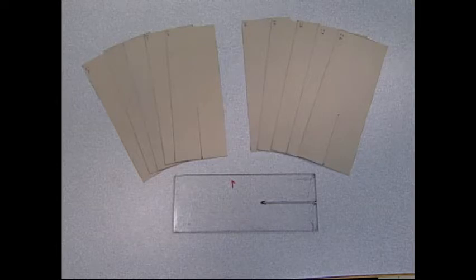The tongue tear test is also referred to as the single rip procedure. ASTM test method D2261, test method for tearing strength of woven fabrics by the tongue, single rip method. A rectangular specimen is cut in the center of one short edge to form a two-tongued or trouser-shaped specimen. The fabric is tested in both the warp and filling directions.